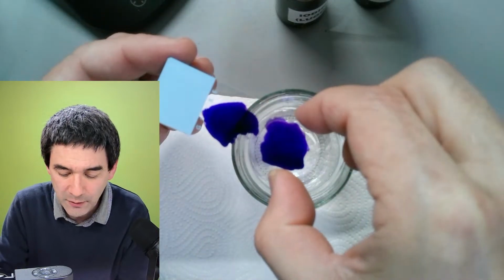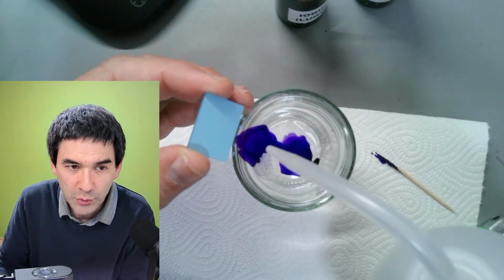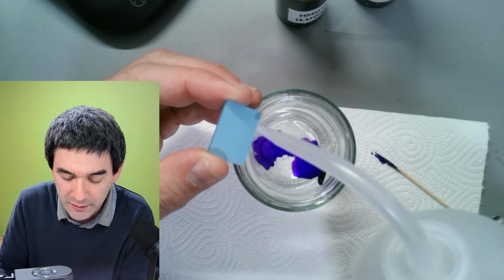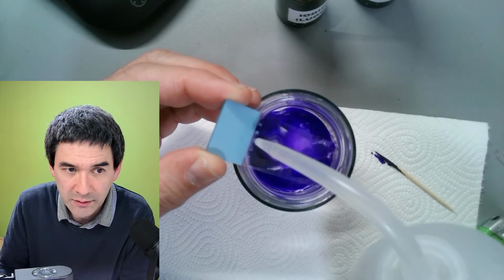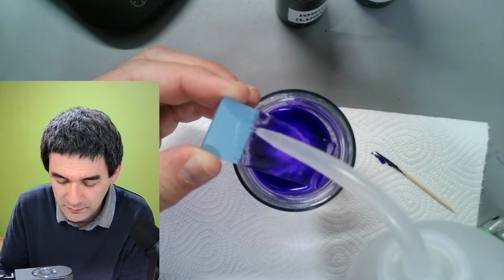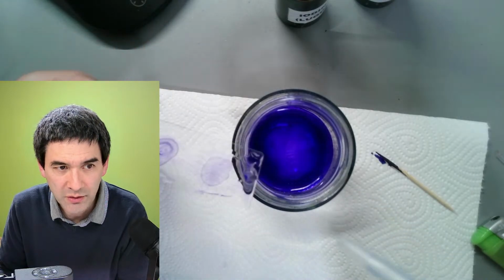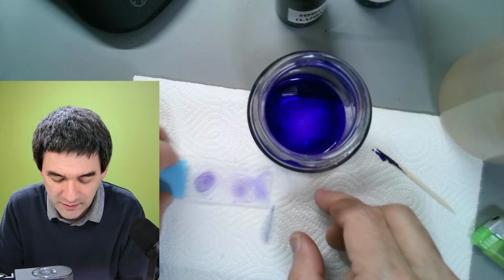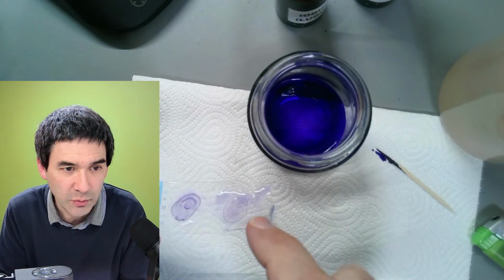I'm taking this now. Over here I've got water. You don't put the water directly on the bacteria, but above it, okay? And you simply allow it to carefully run down, okay? So that's basically the washing stage. What do you notice? Look, yeah, they've stained blue. Okay, you can actually see it now quite nicely.